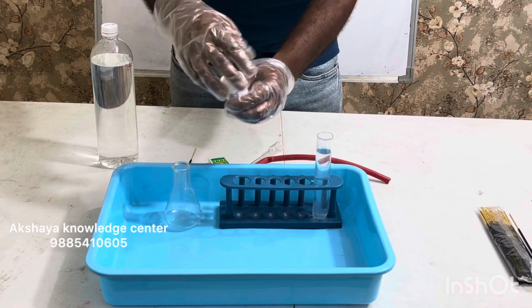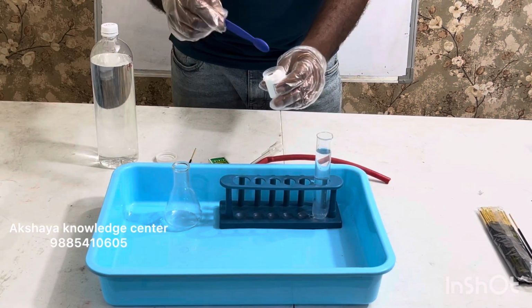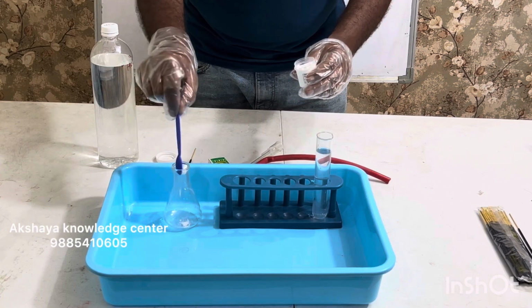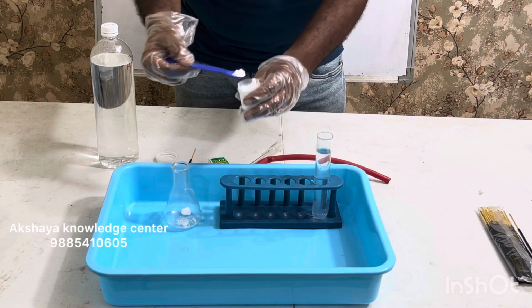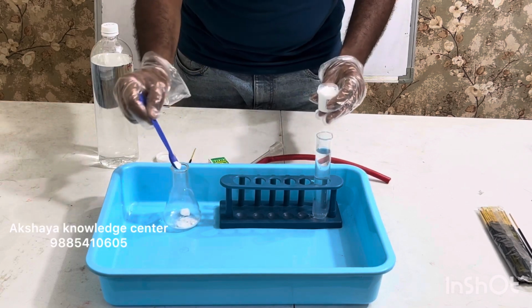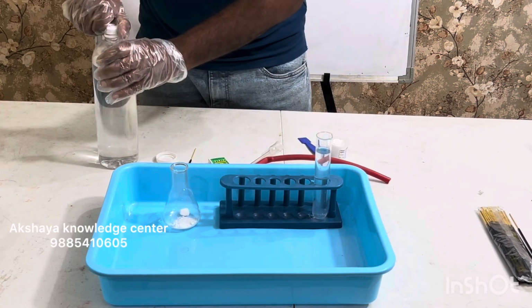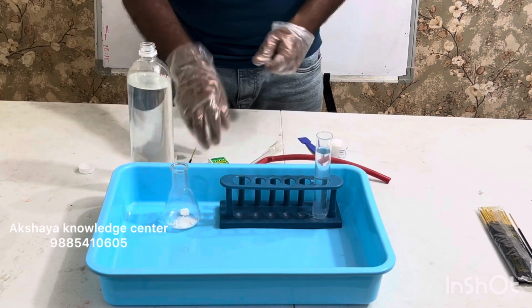First I'll take a spatula. This is the spatula. And I will add calcium carbonate powder into my conical flask. And then I will add our dilute hydrochloric acid.